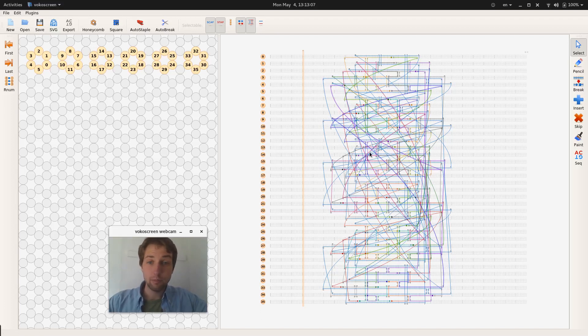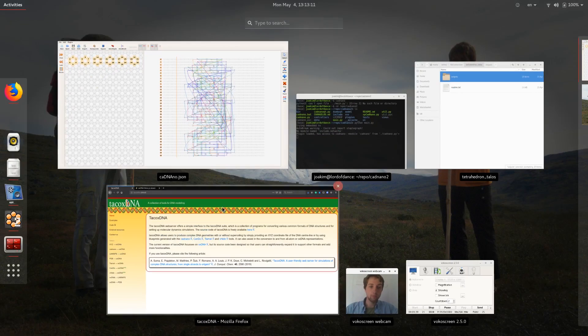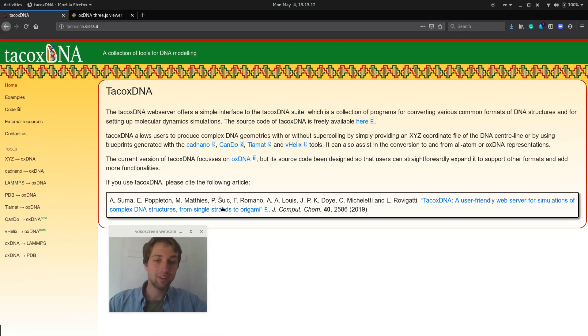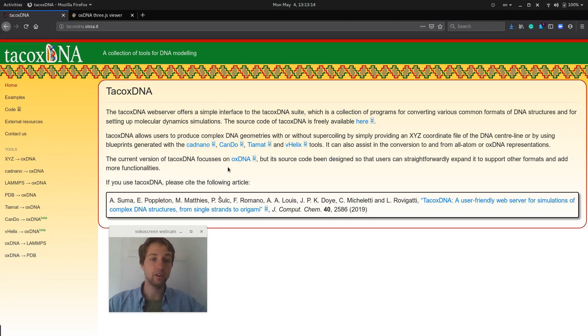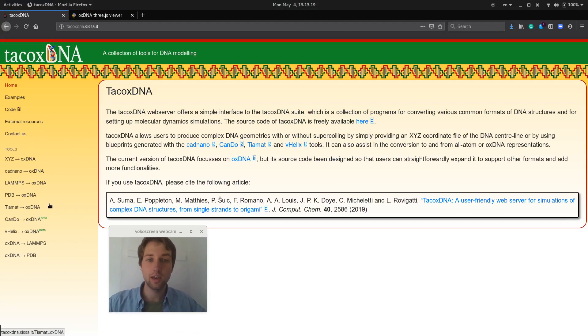So the first step to get from Cadnano to OxDNA would be to use this TacOxDNA toolset which has lots of nice scripts for going from different formats to OxDNA and sometimes back again.